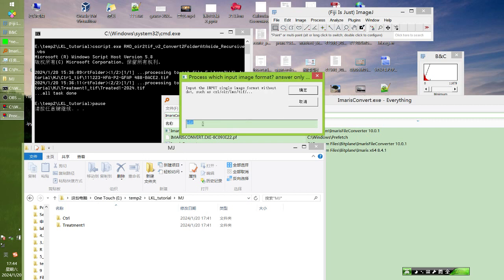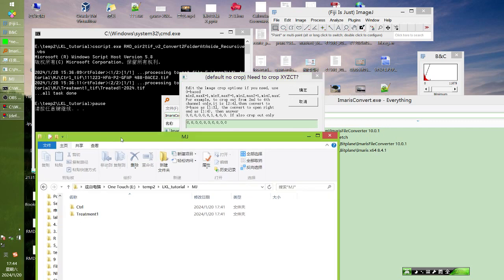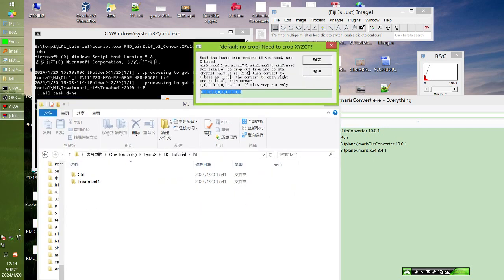The input can be CZI or IMS or even TIFF, so it is very flexible, it can convert among these formats. You can convert CZI to IMS, CZI to TIFF, or IMS to TIFF, or IMS to IMS. So the output is TIFF, and we want to extract OME TIFF. Always use OME TIFF, because next we need to crop a channel, because for the Labkit training we need to extract only one channel. So I will show you how to.